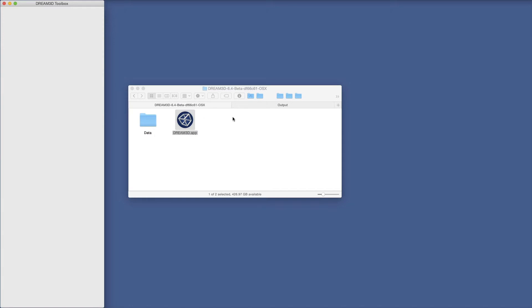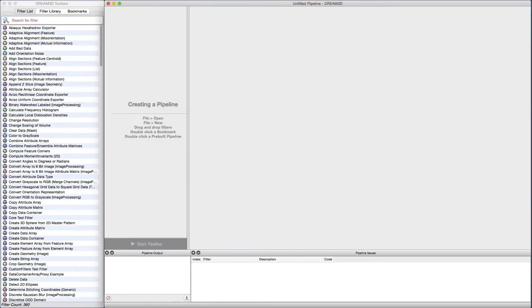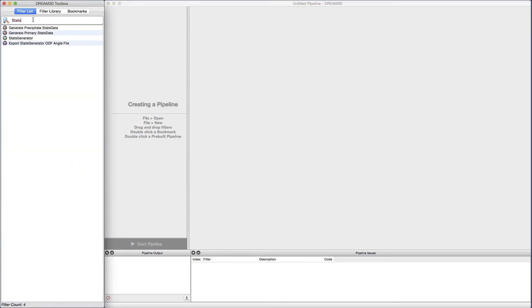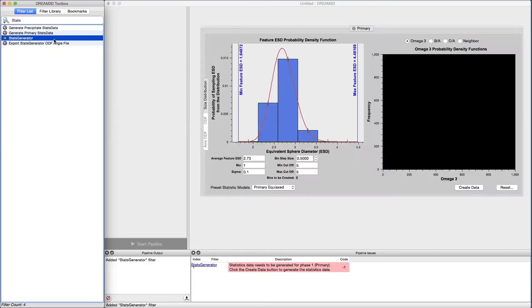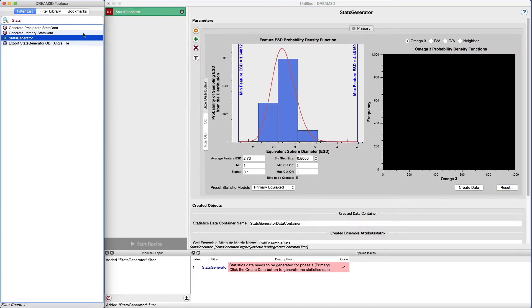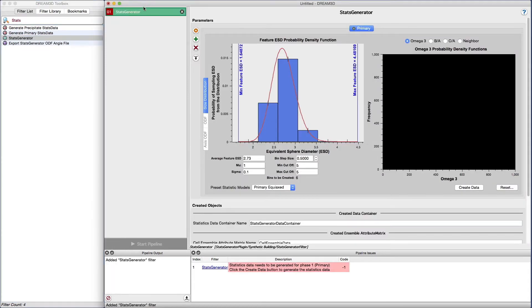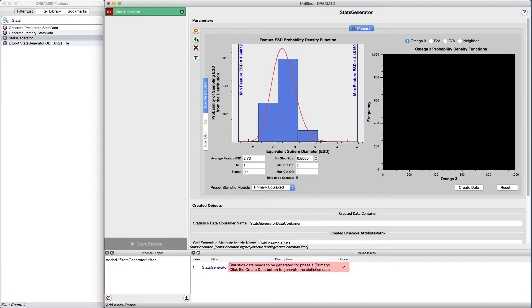Open Dream3D and select the stats generator from the filter list. This presents the user interface that will be used to input all the parameters that go into generating the needed statistics. When the filter is initially inserted into the pipeline, a default primary phase is created for the user.